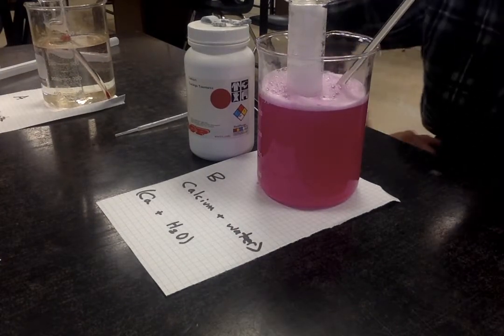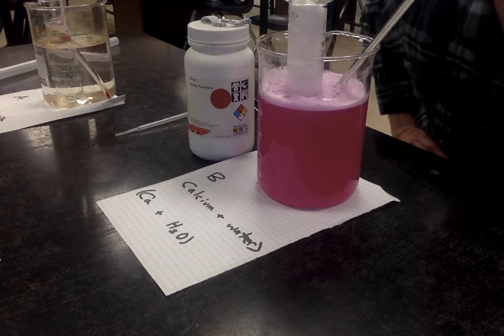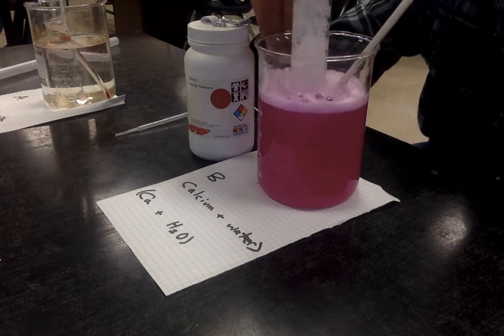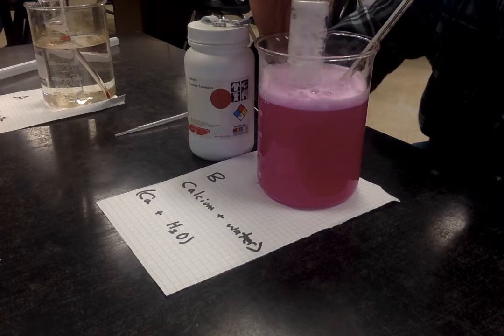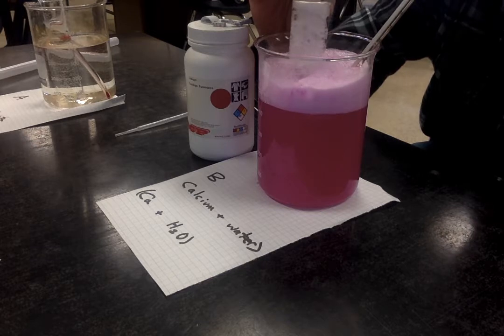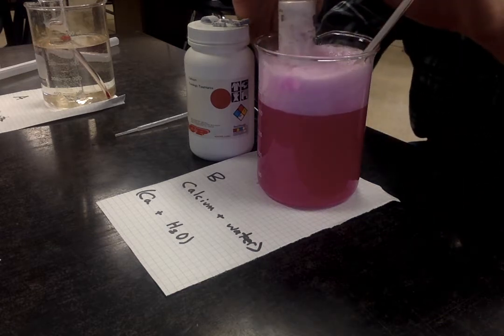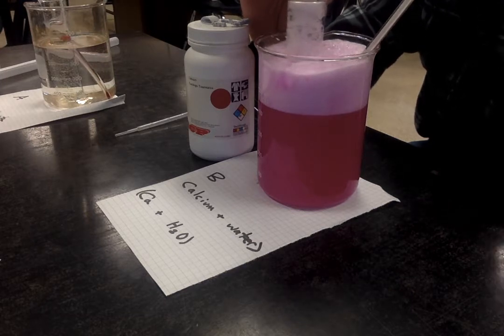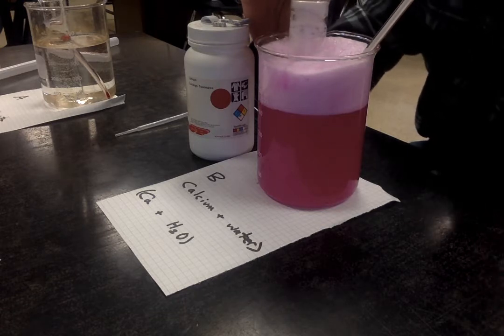In fact, in that short space of time since the reaction started, and maybe you could time that based on the video, it's hard to say exactly how long it took. We have had total filling of the graduated cylinder. Maybe it took, from when I first mentioned it, that long for the graduated cylinder to fill up. After whatever time it's been for the zinc, there is still no gas created, and in addition, the temperature has not changed.